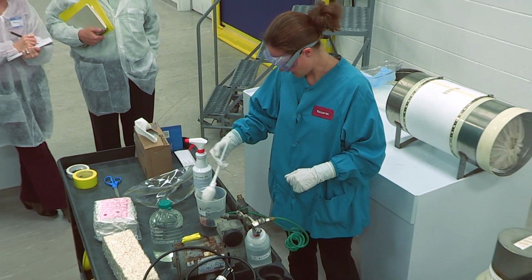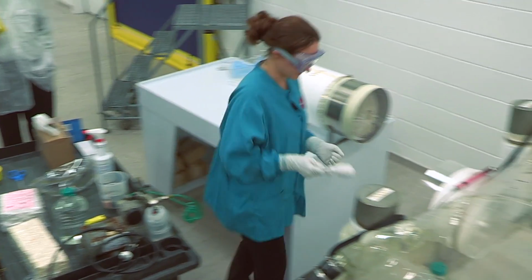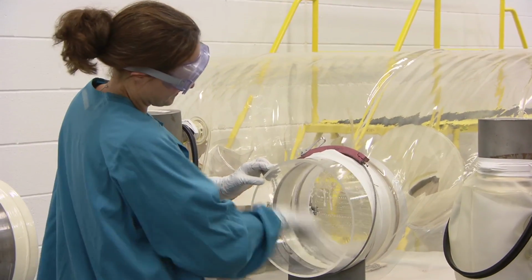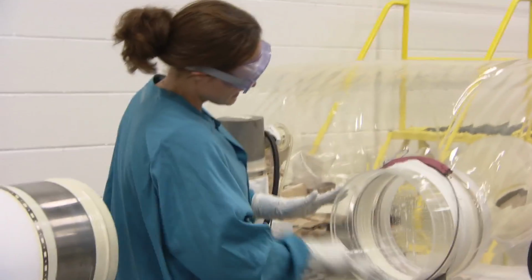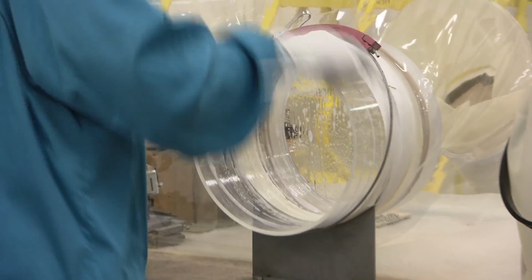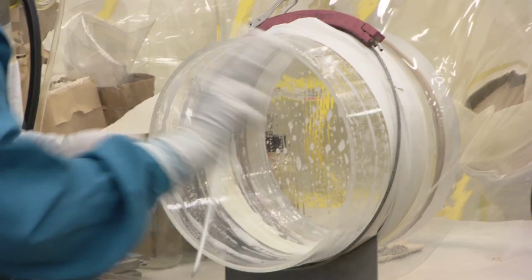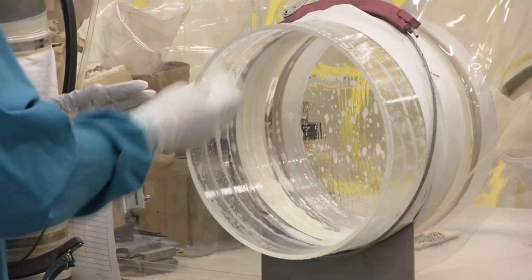And now we can go ahead and, using the same sterilant, swab our port, all along the face of the inside cap. Run it all around the inside. And then we like to go about 3 inches along the outer part here, and then along the face of this ridge.